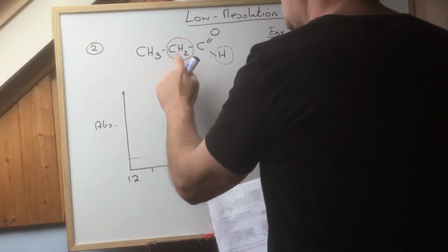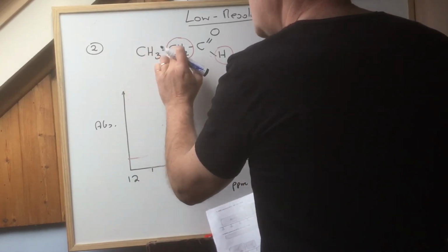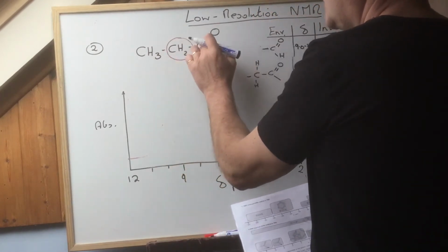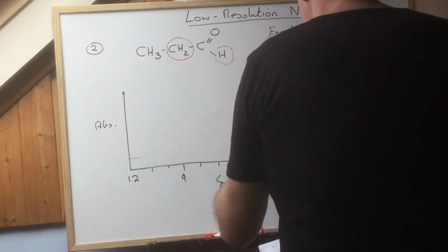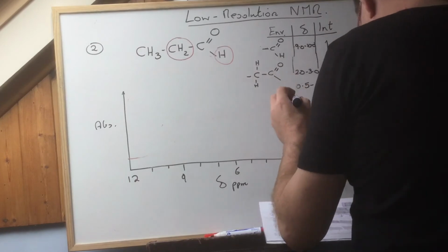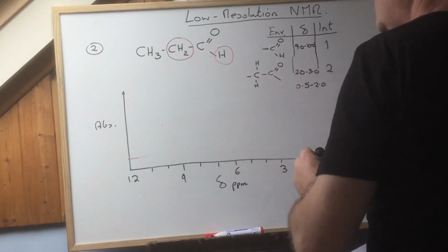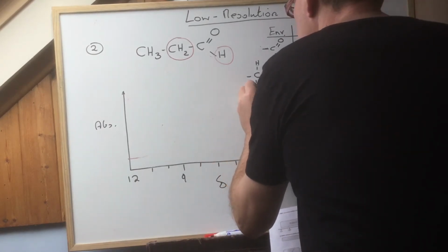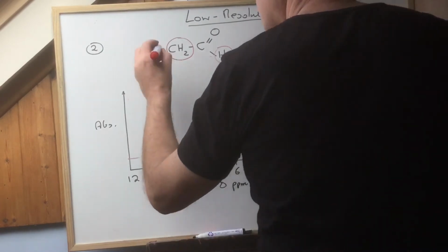Okay. So, I haven't explained that very well, but take my word for it. When you get a hydrocarbon chain here, those 2 have their chemical shift dictated by this C double bond O, but these 3 here are straight away in the 0.5 to 2.0 region. When we do loads of these, you will see, and they are H, C, R. Those there.